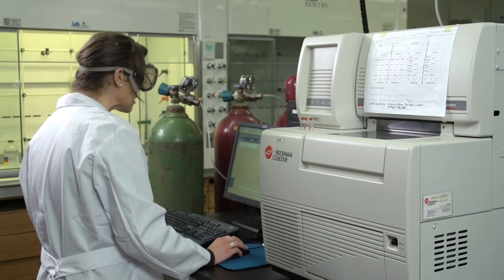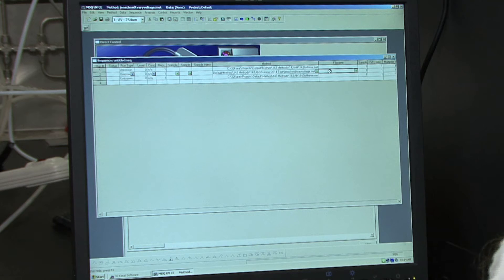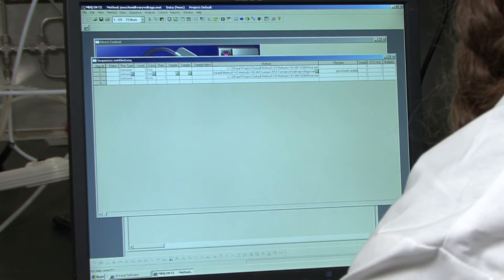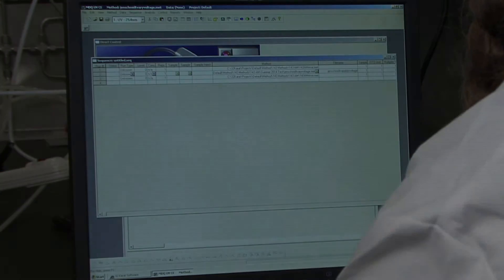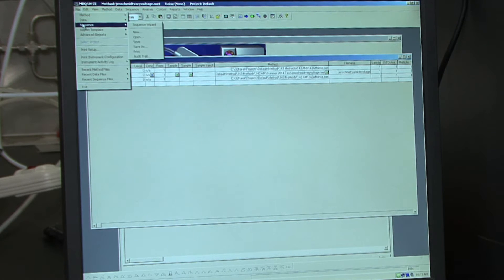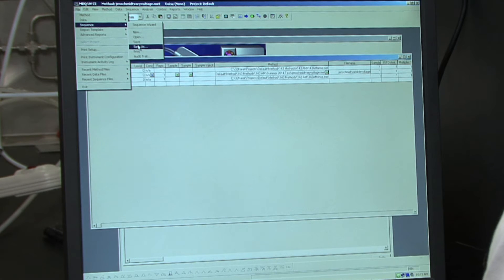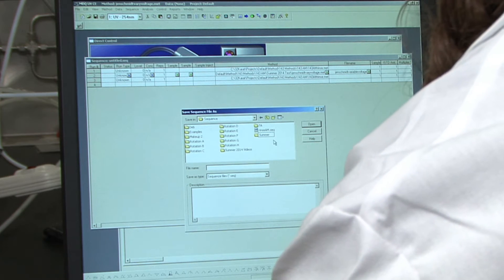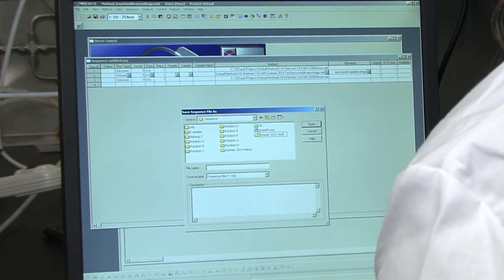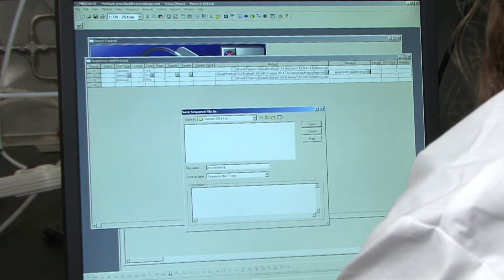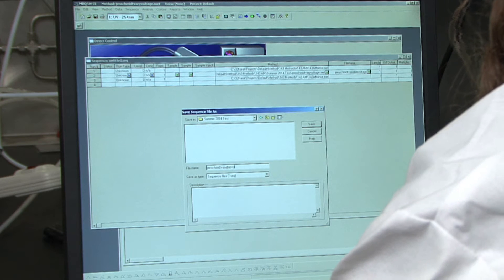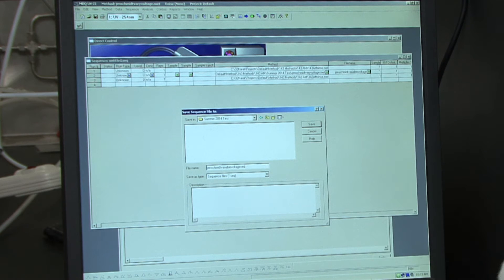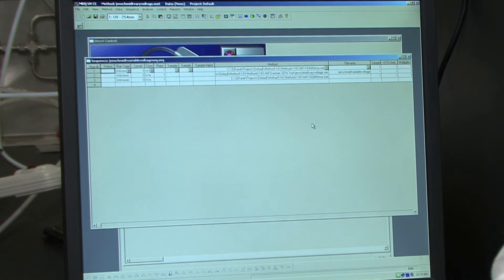So you need to enter file names for your variable voltage method. Type in your Hawk ID and variable voltage. Now we need to save our sequence before we run it. So to do that, we'll just go again up to file, sequence, save as. I'm going to create a new folder here. And again, save it with your Hawk ID and variable voltage sequence.